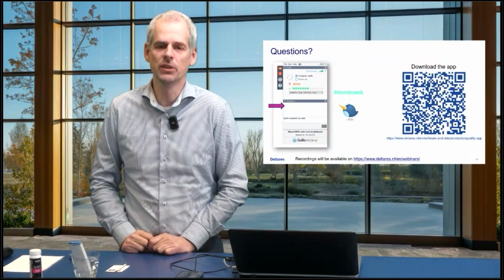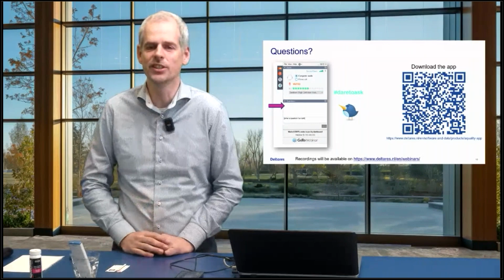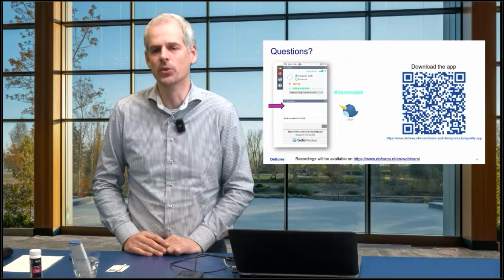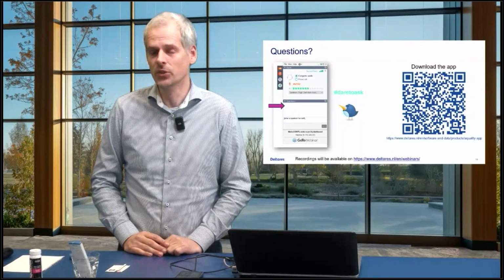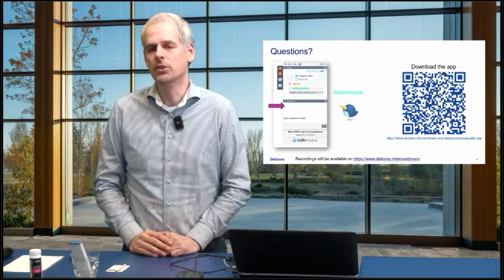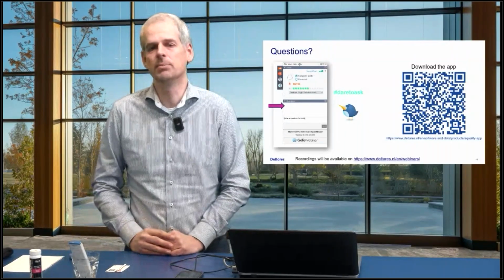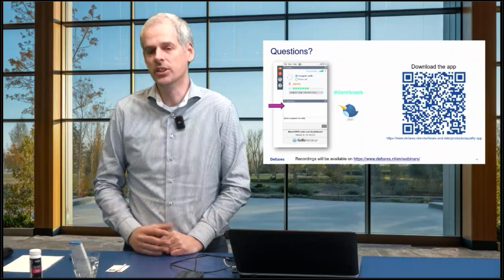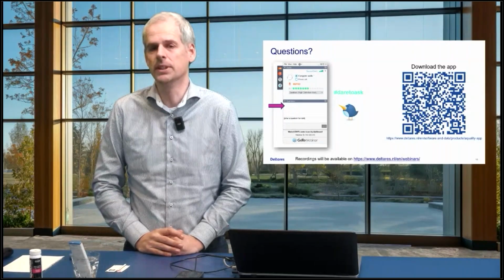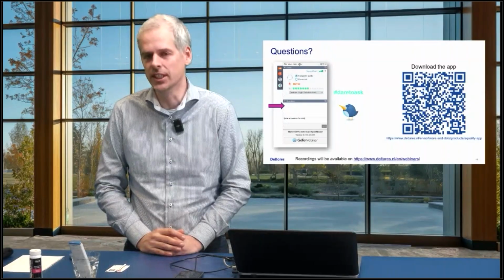So if you go to our website, we have been giving a QR code, but you can also Google Deltares Aquality. There's also a link to a web platform, and there you can download a CSV file for all public measurements. But if you use the group functionality, or you have stored measurements as private, you can get separate CSV files and download that for your own group, and then you can work in it within Excel or within GIS.